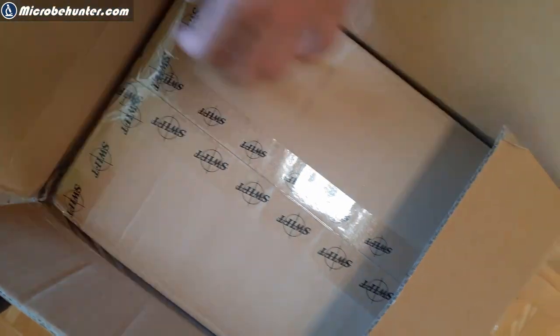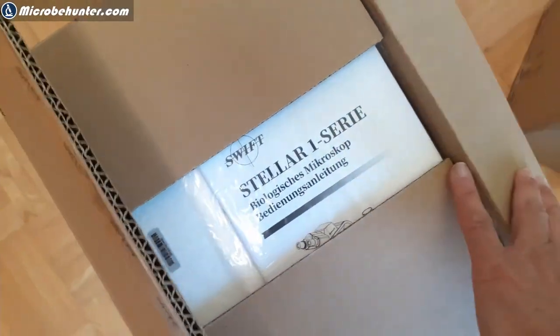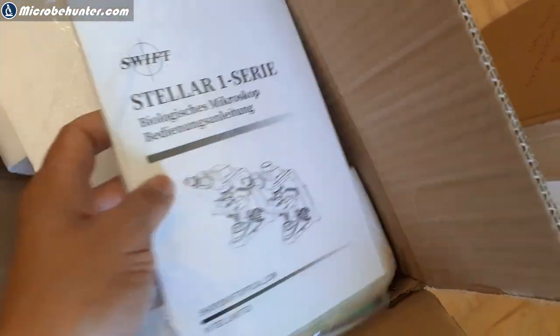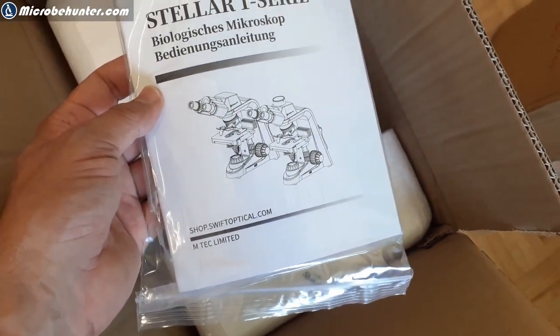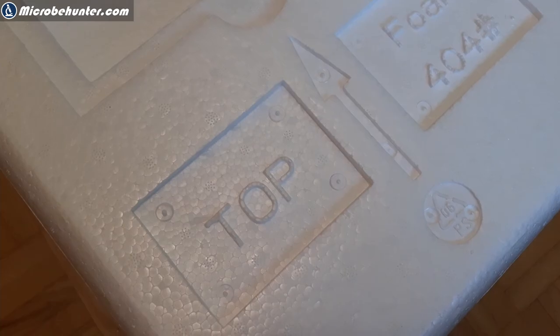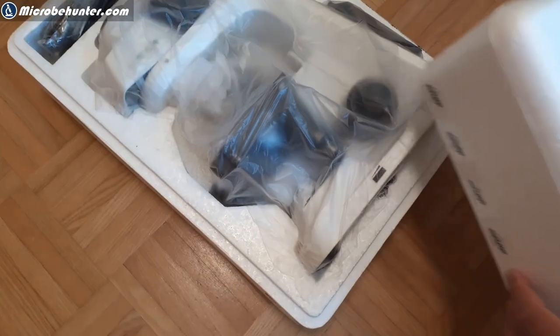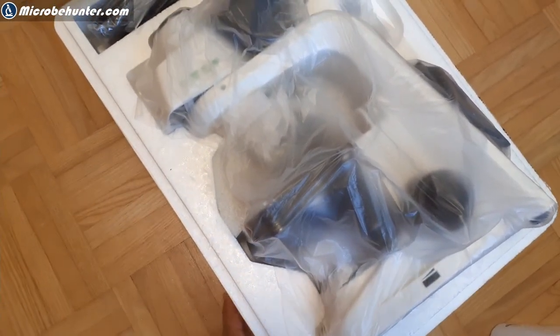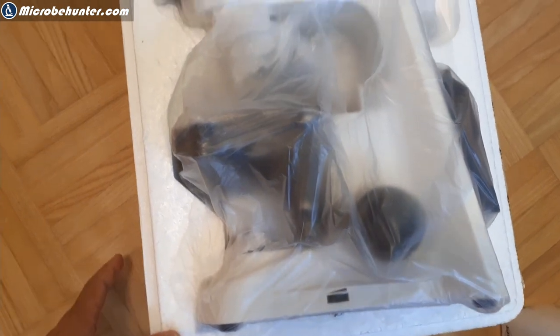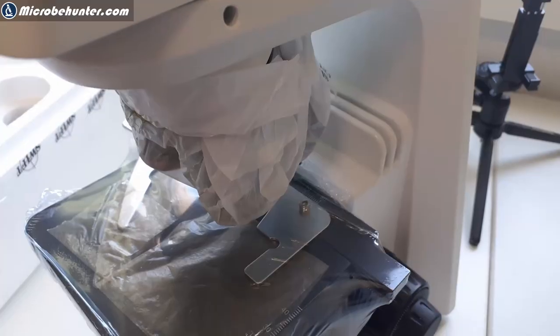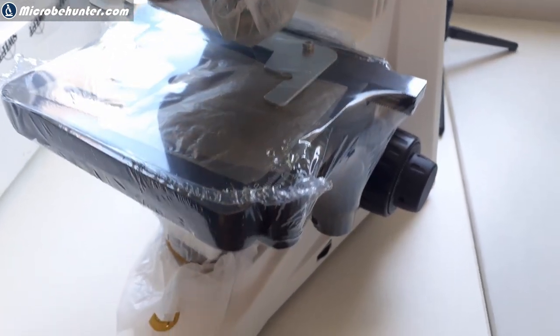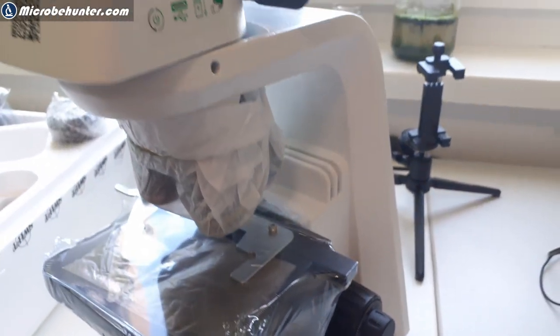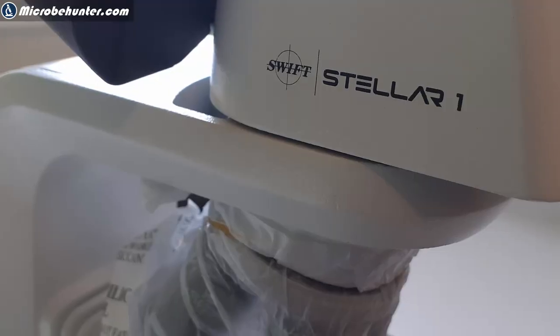Well, the microscope came packaged in two boxes. And the first thing which was visible was the instruction manual. And it was a quite a decent one. As a matter of fact, they supplied me with a German version, which is fine. The box itself, make sure that it has the correct orientation. Top must be on top. Otherwise, all the parts are going to fall out.